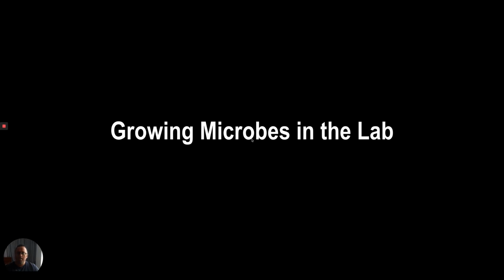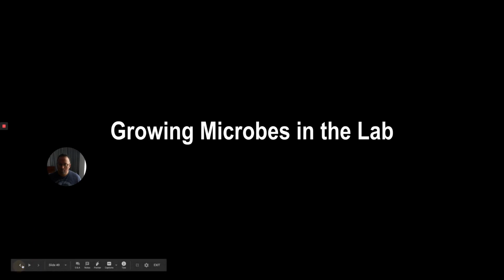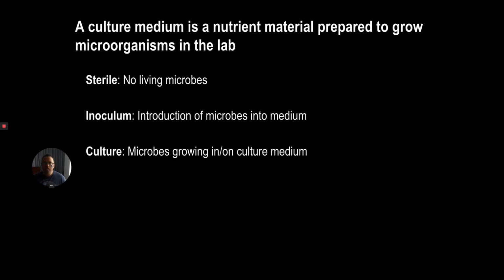All right, so now let's start talking about growing microbes in the lab. So, a culture medium is a nutrient material prepared to grow microbes in the lab. A couple of things that we need to be absolutely certain about if we're doing that. First is that it's sterile. There can't be any microbes in it, right?